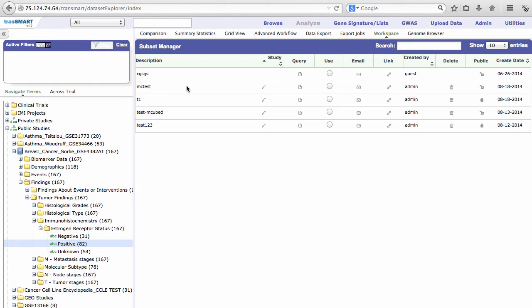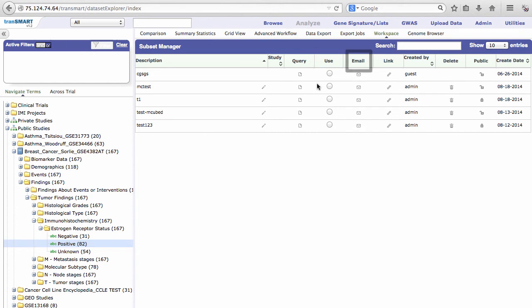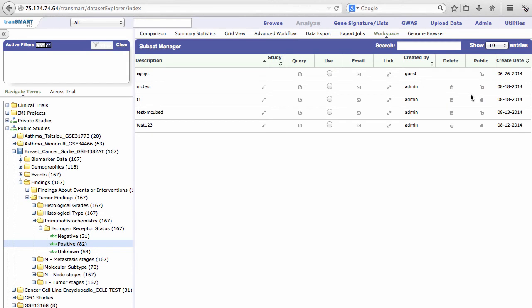In the Workspace tab, you can access your own saved subsets, as well as saved subsets that other users have made public. The query icon provides a description of the subset. You can email your subset, create a link for your subset, and also change your subsets between private and public.